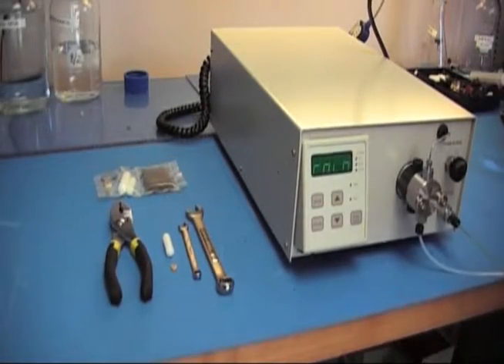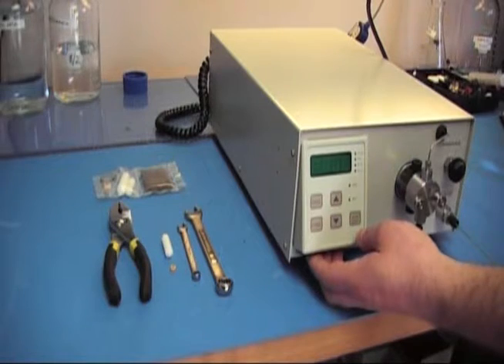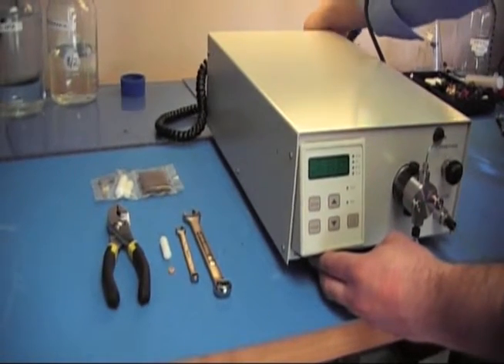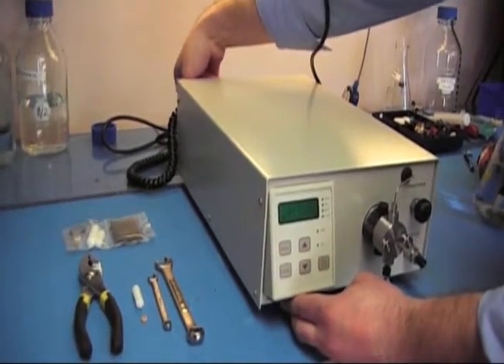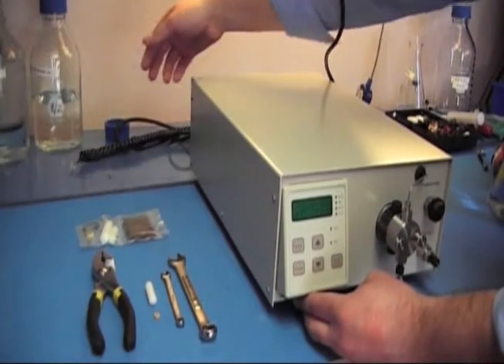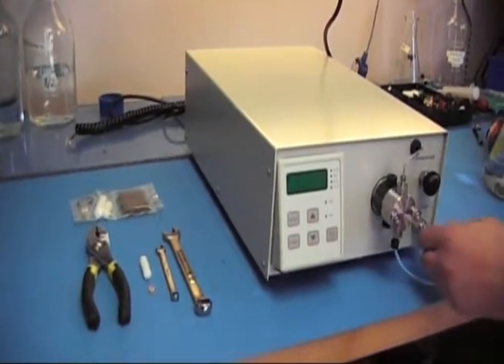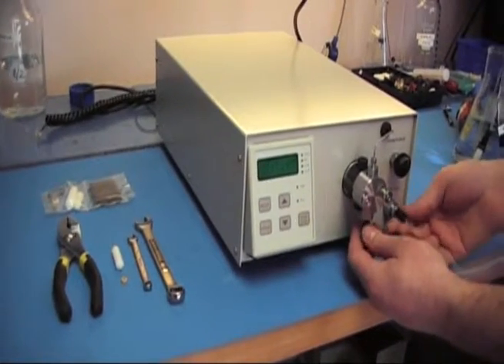Before we get started, make sure you power down your pump. Make sure your power cord is unplugged from the back, as well as any communication lines you may have hooked to the back. And remove all tubing from your fluid path, your outlet and your inlet.